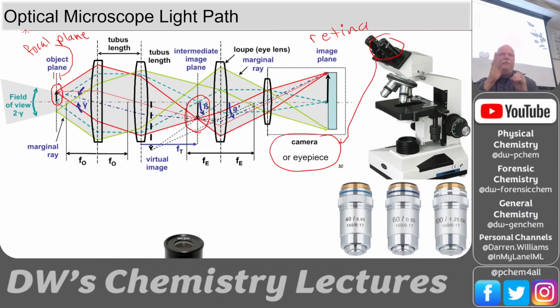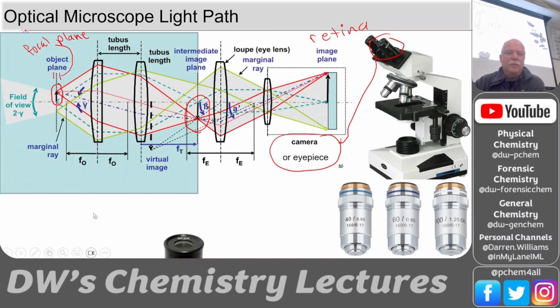And if the eye is not positioned horizontally in the correct spot, you can move those eyepieces in and out until you see the image overlay. And then this eye typically needs adjustment. Most of our corneas are not exactly identical, so you can adjust this eye till they're both in focus. So the interpupillary distance is an adjustment, and then also the differential focus of your eyes. So it works great.